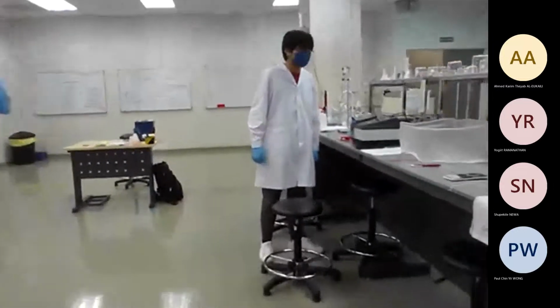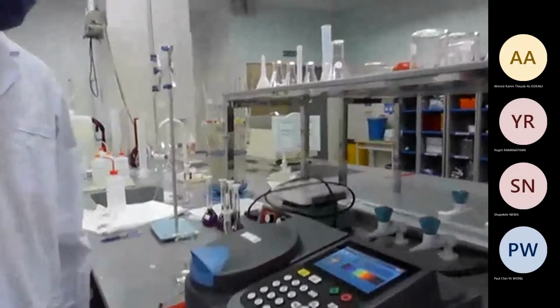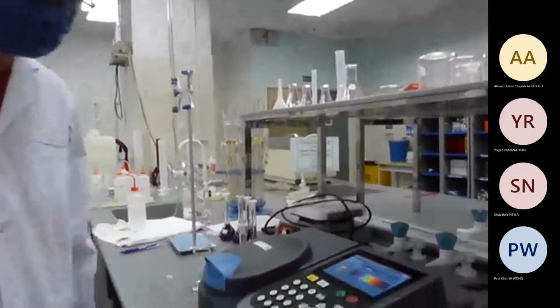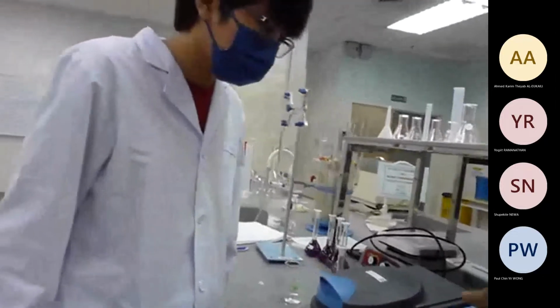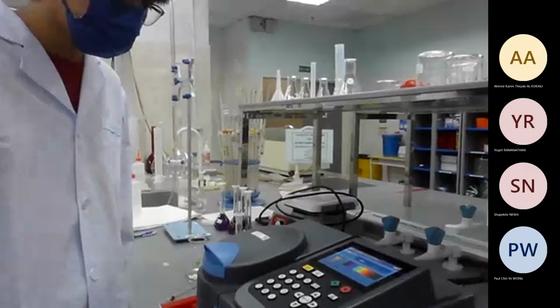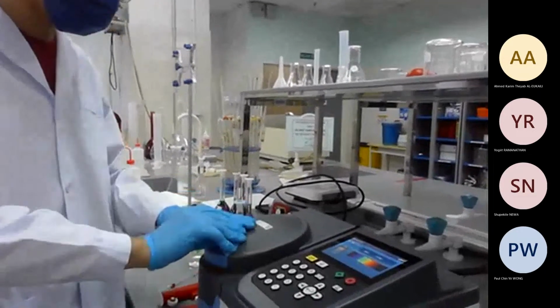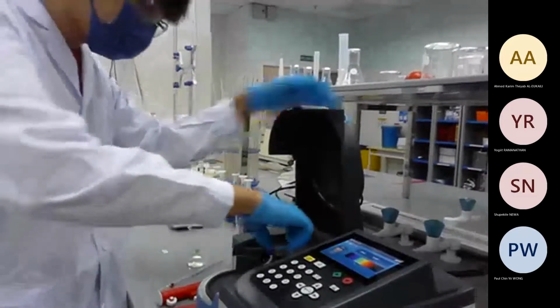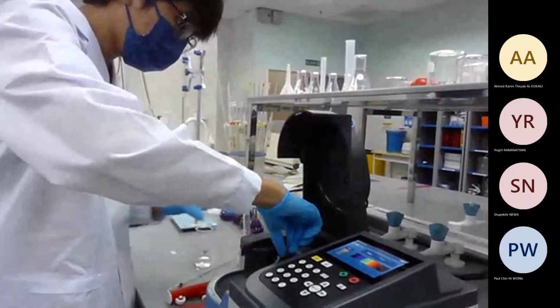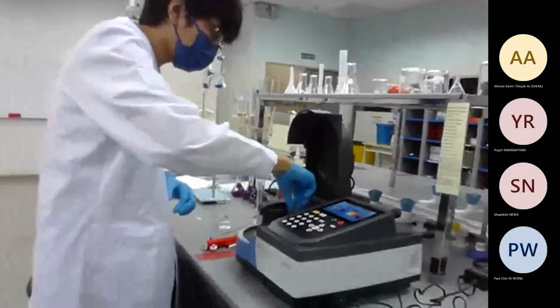We don't remember how to get the zero absorbance. Sorry? Have you put the blank? Yeah. Then press 0. This one? Yeah. Take it out. Open it. Take it out. And put the sample now. No need to press anything. If you put the sample, it will automatically give you the absorbance. Yeah. Take it out. Put.